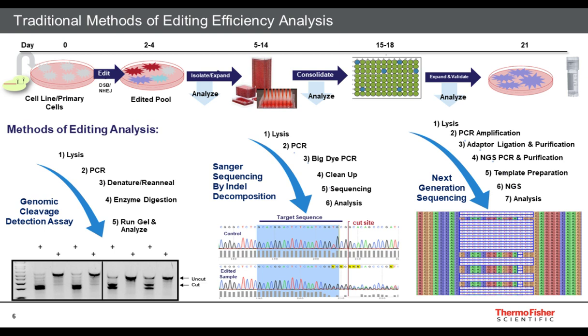but this is a lot of work. All of these steps are a lot of work, and in the meantime, you're growing the cells as this is all happening, taking your lysates out, going into the wet lab, and doing a lot of additional hands-on work and using a lot of additional reagents to do this.